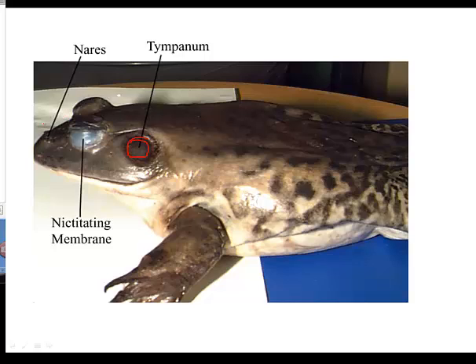And then you have the nares. These two, right on the snout, are the external nares, because they're outside. You should be able to take your probe and insert it through the external nares, and when you open the frog's mouth, you'll see it come straight through to the inside. So the external nares are the holes on the outside, and the internal nares are going to be the holes on the inside.